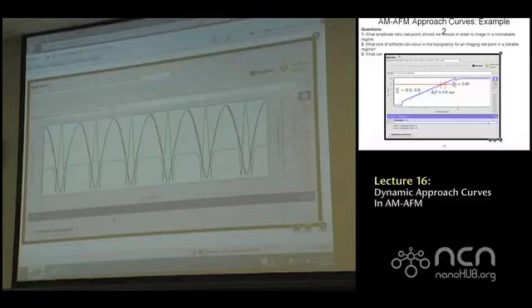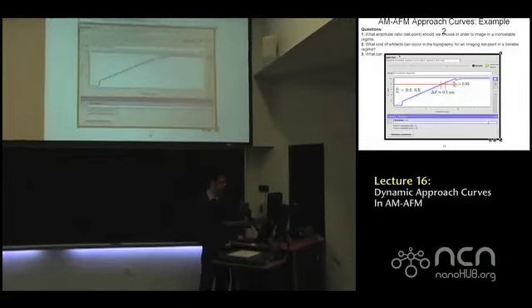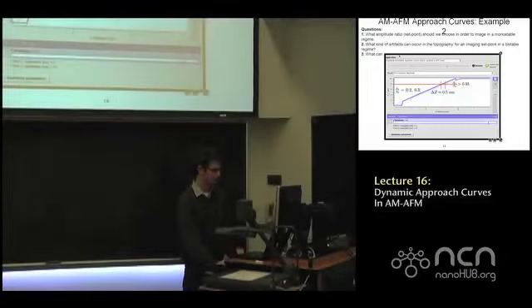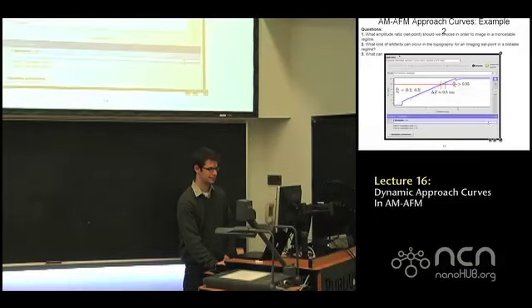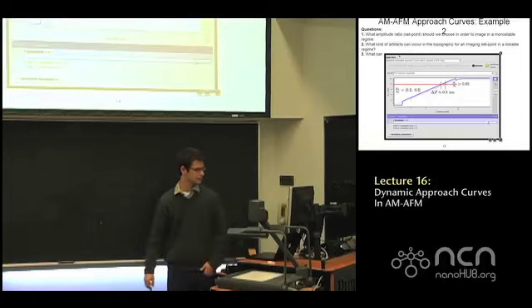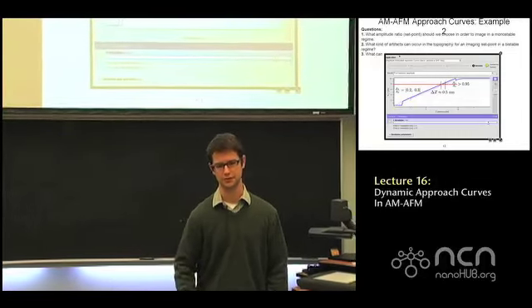I think that's it, we're a few minutes early, but do you guys have any questions? You didn't get 0.8. Did you break it? That one is a little bit tricky sometimes. Did you do the retraction curve or the approach curve?